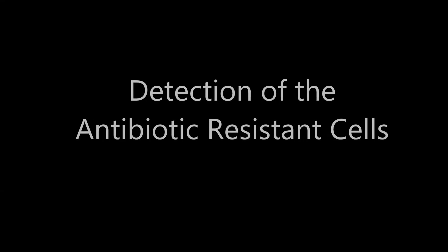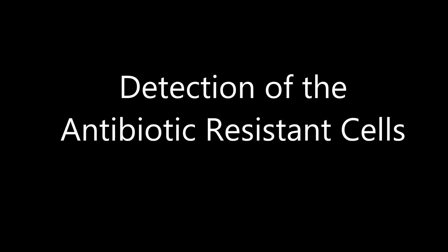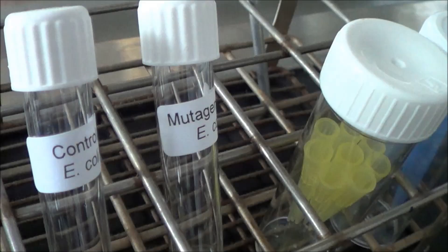Detection of the antibiotic resistant cells. Once your antibiotic plates have set, you are now ready to plate your cells onto the antibiotic selection agar plates.